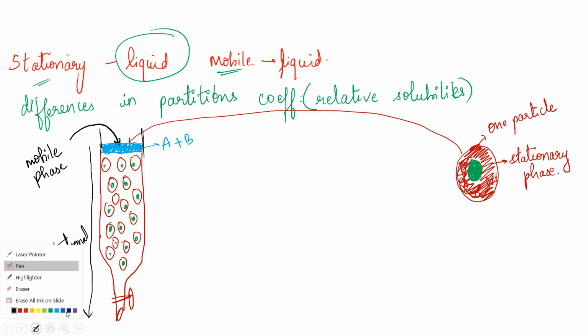The mobile phase is full with buffer. When you add the mobile phase, it is a liquid, so it will go and cover all the gaps. It will run between all the gaps between the stationary phase. The stationary phase is tightly packed, and the particles are very close to each other. I haven't drawn that detailed diagram here, just for you to see that the mobile phase is actually able to run through the column.